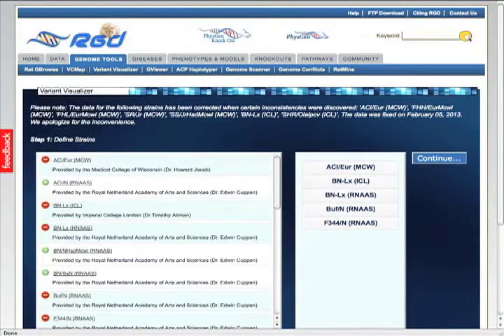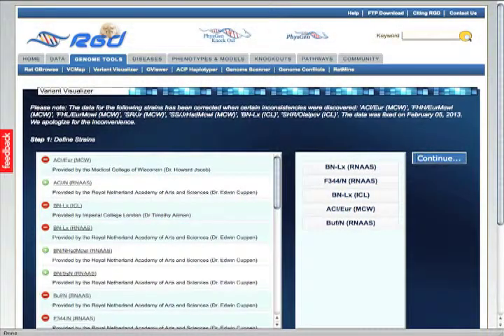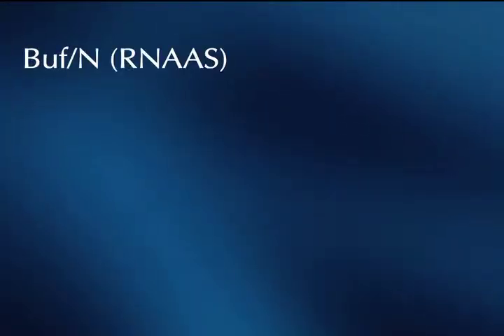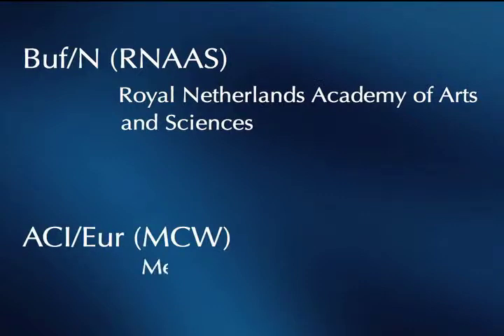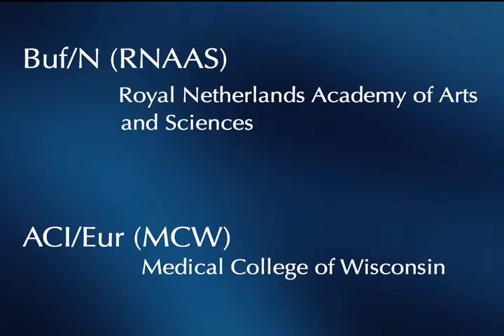The strains begin in the order in which they were selected, however, you can drag them to change the order. The order they are in once you hit continue will be the order they are in once you reach the information screen. The variant data source is given as a lab symbol in parentheses following the strain symbol. This is indicated by an abbreviation for the institution such as RNAAS for the Royal Netherlands Academy of Arts and Sciences and MCW for the Medical College of Wisconsin.